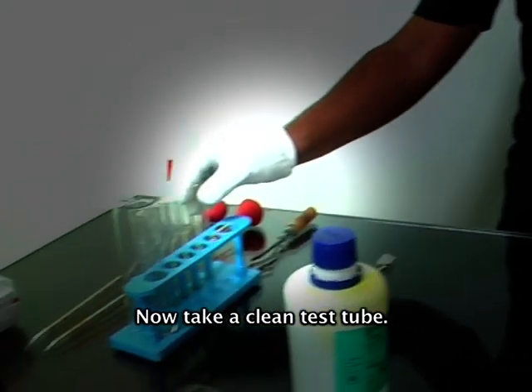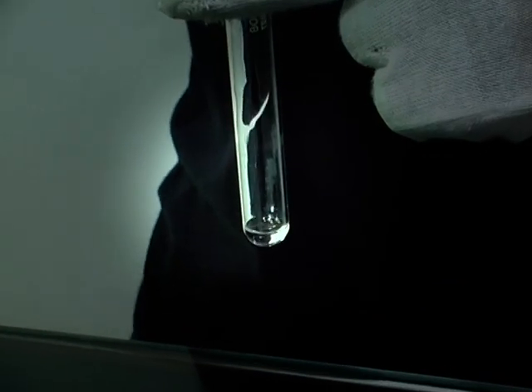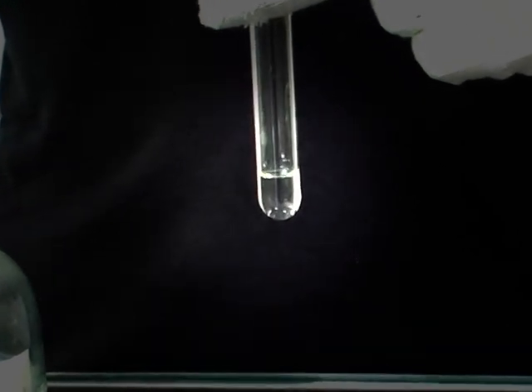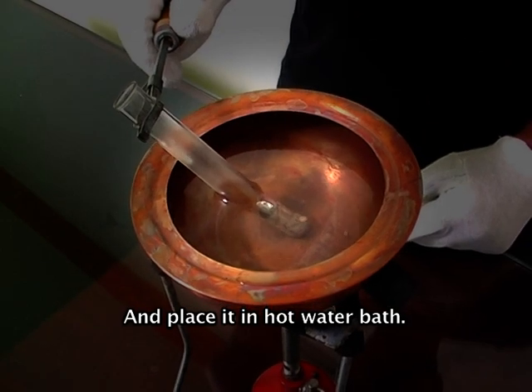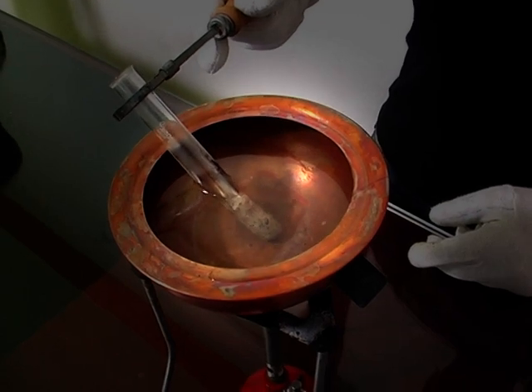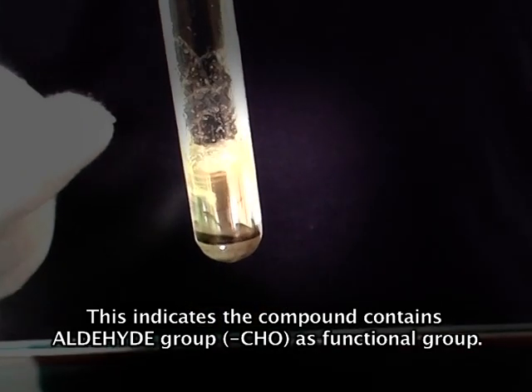To confirm it again, we have another experiment: the silver mirror test. Now take a clean test tube. With the help of a pipette, add few ml of sample. Now add few drops of Tollens' reagent to it. Hold the test tube with the holder and place it in a hot water bath. Now we can observe silver mirror formation on the inner walls of the test tube. This indicates the compound contains an aldehyde group as a functional group.